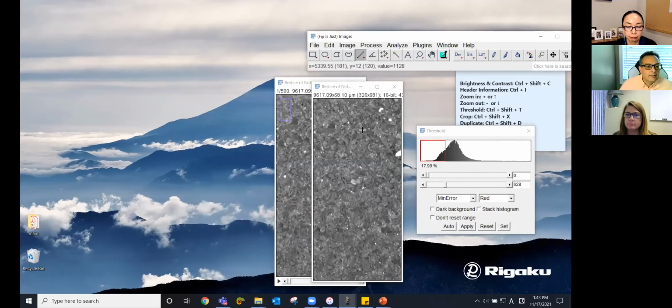Okay. All right. So Don came back a little more specific here. It's not a commercial version, but just a version of ImageJ singularly focused on CT. Right. So ImageJ is fairly broad in terms of what it can handle. It's broad, and it started as a 2D image analysis tool, so it's leaning towards 2D, I think. But more people are using it for CT.